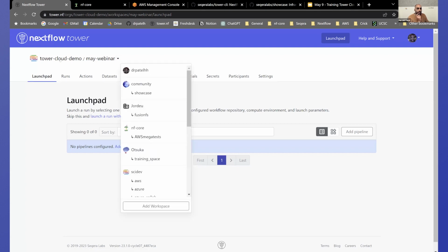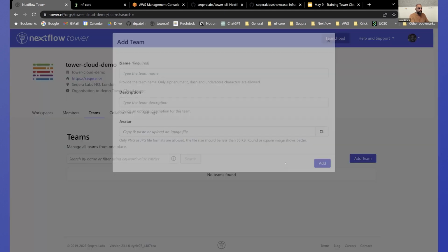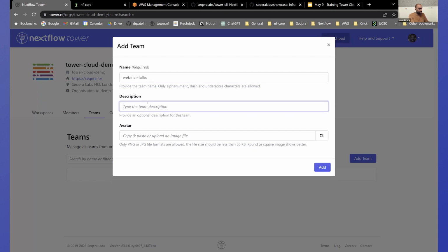But before I do that, in my new organization, I want to add a team. So what I'll do is I'll add a team called Webinar Folks. And so this just means I'm adding others to help me either get Tower up and running, or just to have others to come in to launch these pipelines.